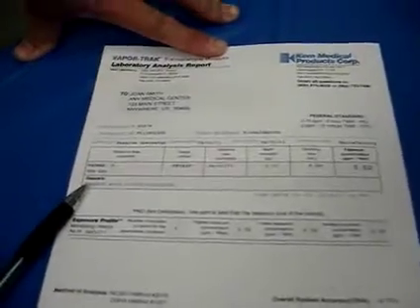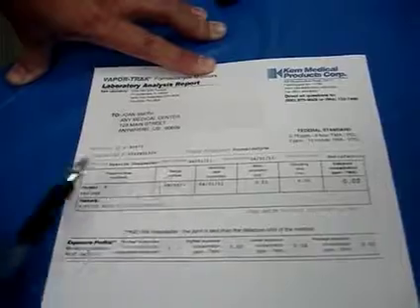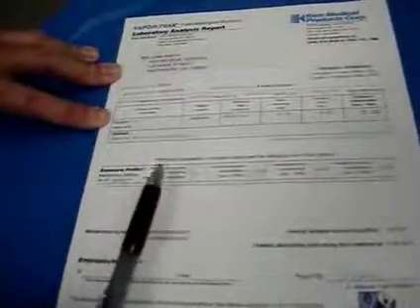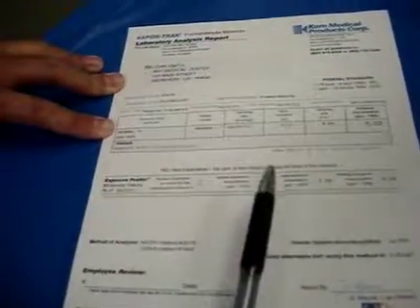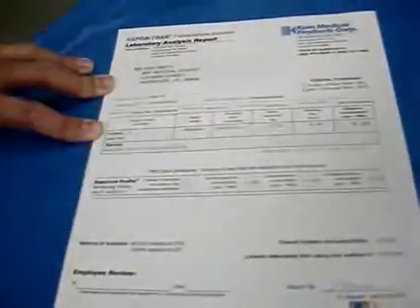The remarks are going to change whatever you wrote on the outside of the mailer box, working with tissue processor, near the sterilizer, whatever the case may be. Later on down the line, when, let's say, this particular person, T. Thomas, used 4 badges, the exposure profile is going to list 4 badges. It'll give you the highest, the lowest, and then the average. But right now, we're just going to concern ourselves with the concentration for this particular badge.